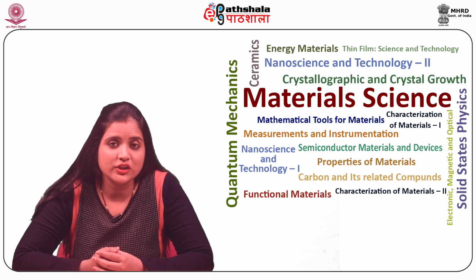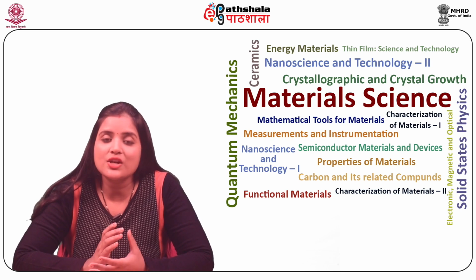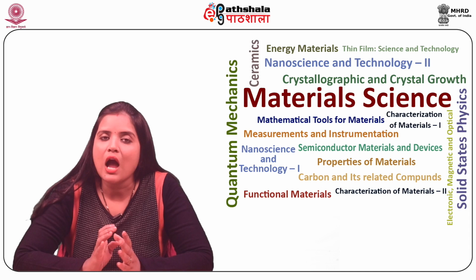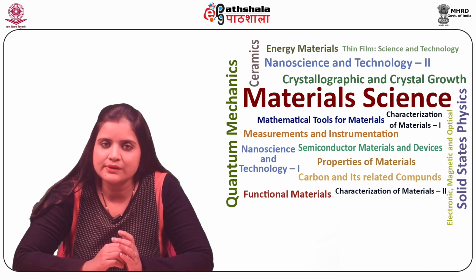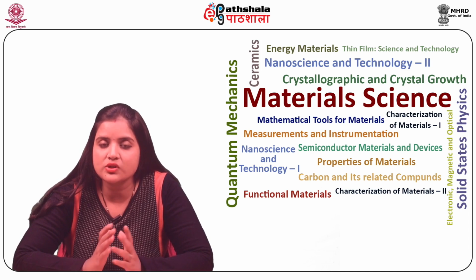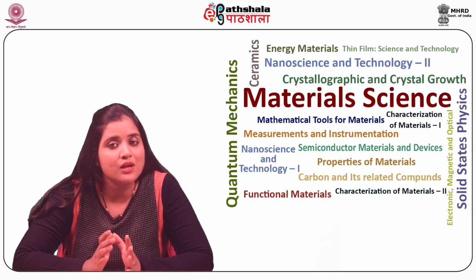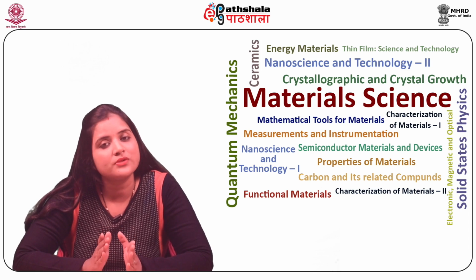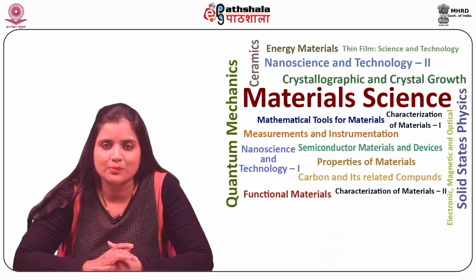Let us now study the properties of immersion oil. Standardization of optical values of immersion oil has gained much interest in the past few years since it forms an integral part of the optical system of a microscope. Consistent values of immersion oil are essential to obtain good quality images from the microscope.